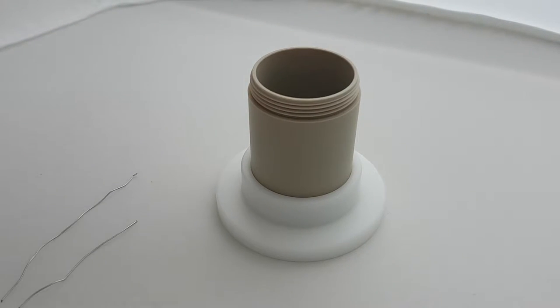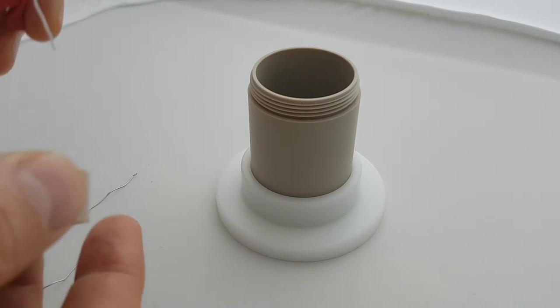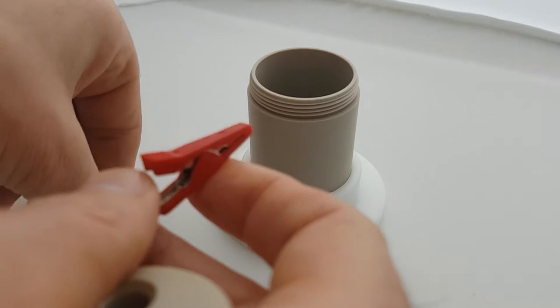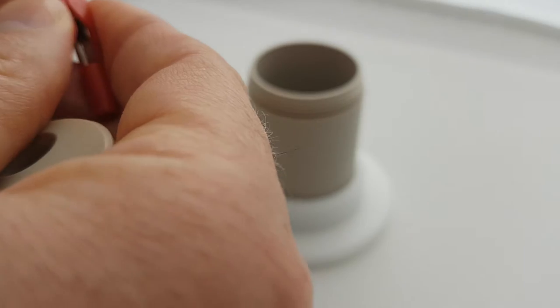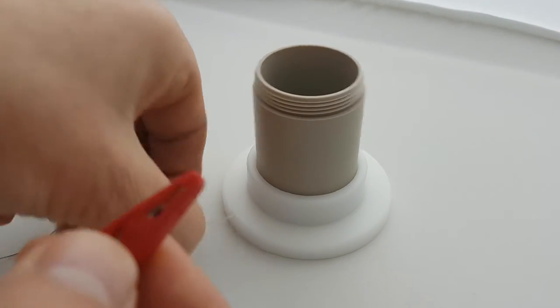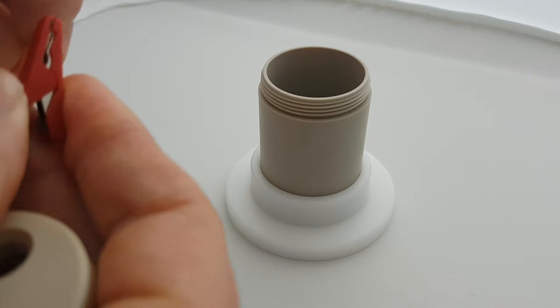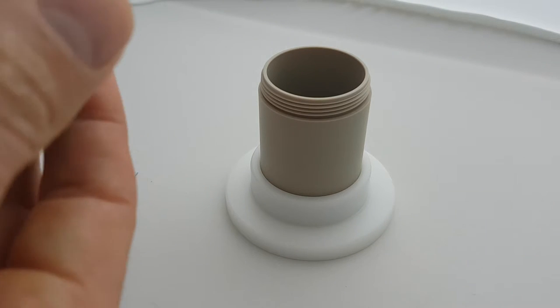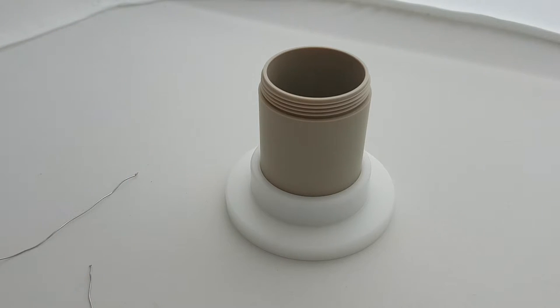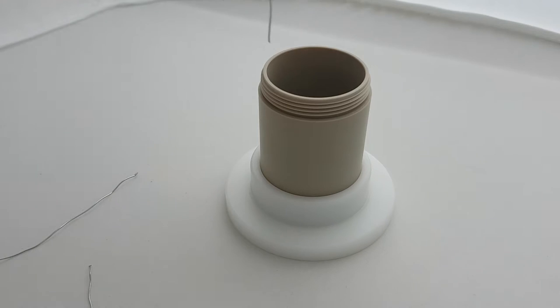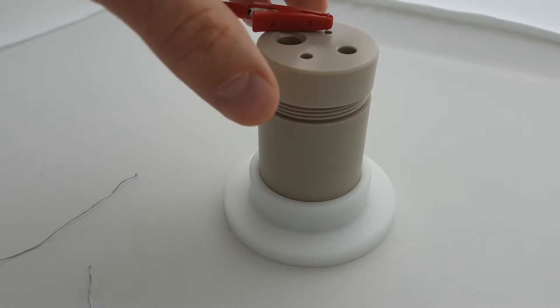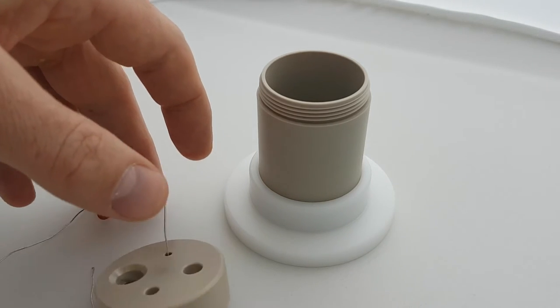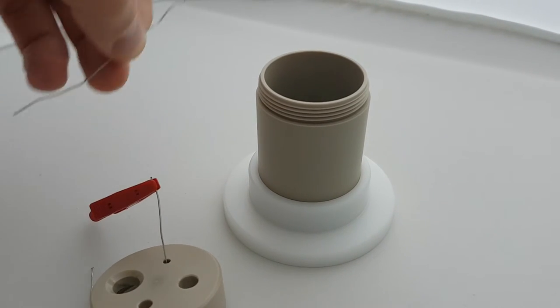So I've got a couple of other sizes with it. I'll go for a 50mm. As soon as you take a 50mm wire, that is plenty of length to actually get into that cell. So 50mm is great. 25mm I feel is just a little too short really.